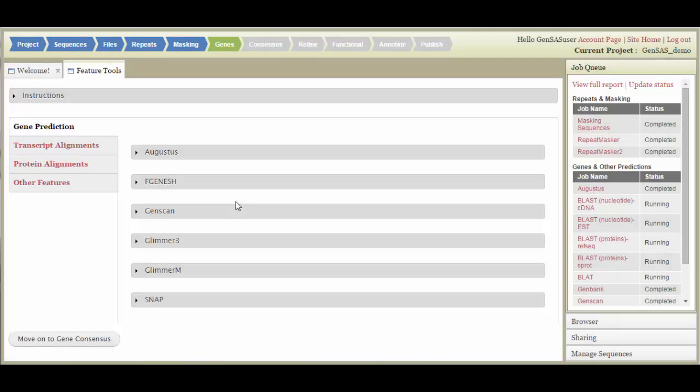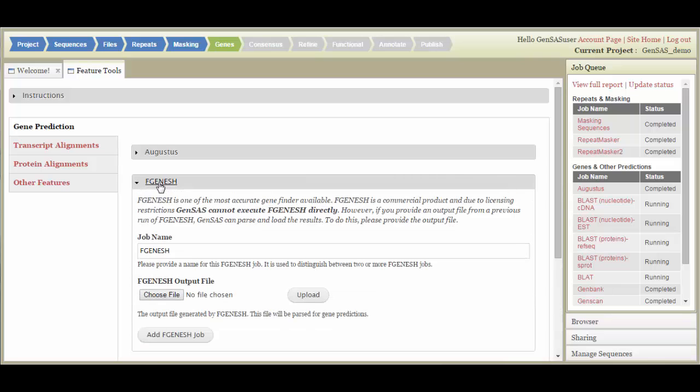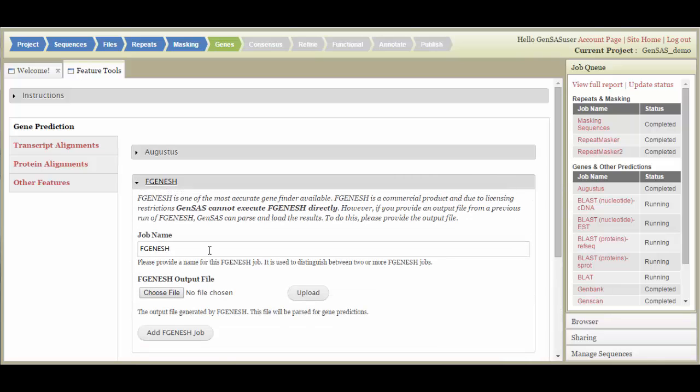On the Genes tab, you can set up a variety of structural annotation tools. There are four categories of tools. Under Gene Prediction, Glimmer3 is for prokaryotes, and the rest of the tools are for eukaryotes. Please note that you cannot run FGeneSH through GenSaaS, but there is a place to upload your data so you can use it in the annotation process.